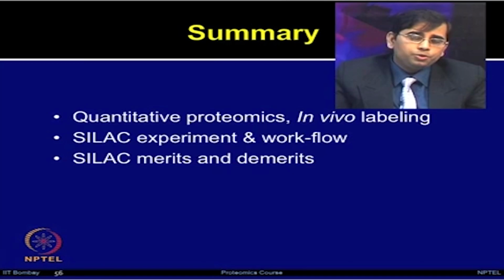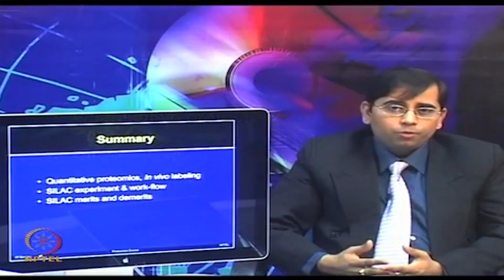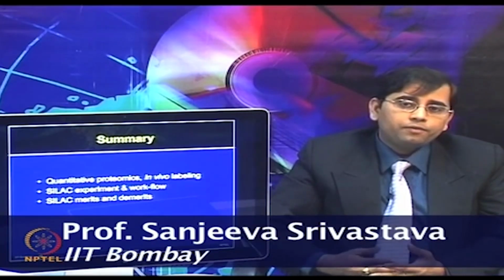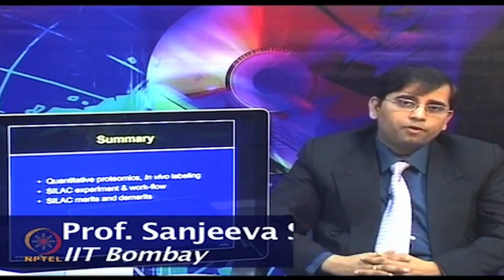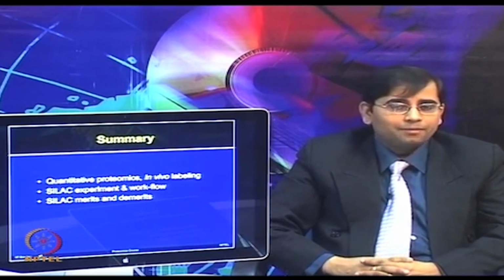The limitations include the use of only cell culture and the metabolic conversion of arginine to proline, but overall SILAC is a very promising technique and its applications are published in several papers. I hope that by today's lecture you are able to appreciate the different types of in vivo labeling methods, the SILAC experiment and the stepwise workflow of performing a SILAC experiment, and the merits and demerits of the SILAC method.